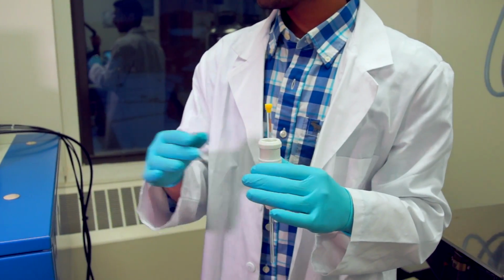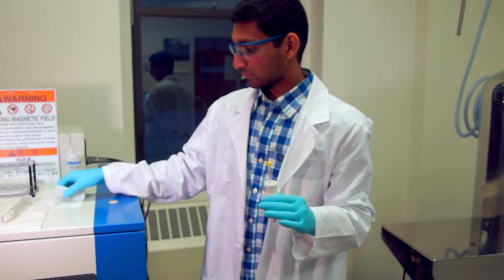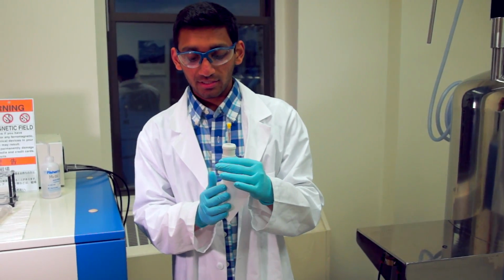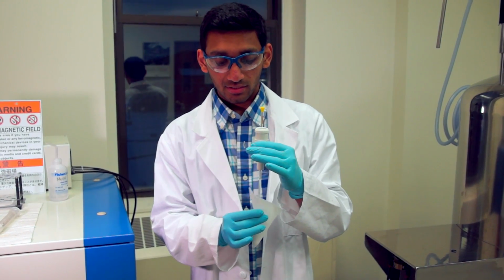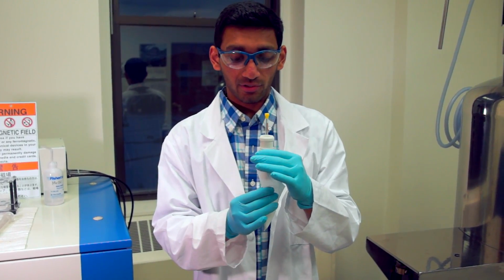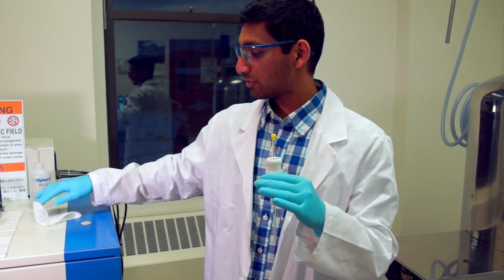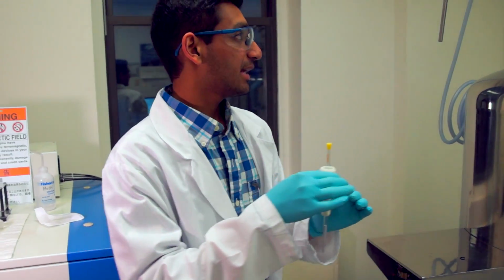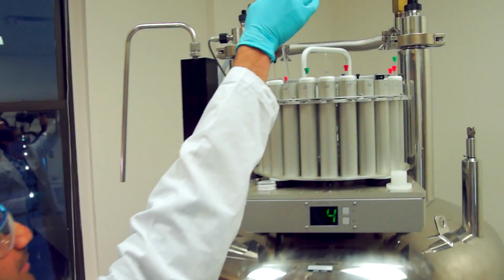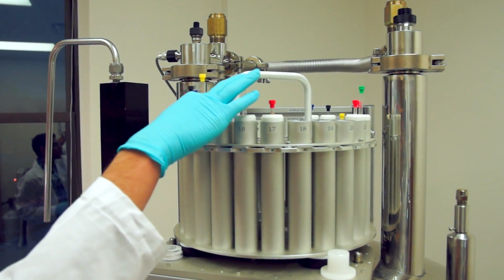Remember to clean the NMR tube with a Kimwipe and methanol. Do this gently because you do not want to move the tube as you have just adjusted its height for the machine. Once the NMR tube is clean, gently place it in the appropriate NMR slot. Remember to keep track of the slot number, as it will be vital to your data later. This is how you place an NMR sample in the NMR machine.